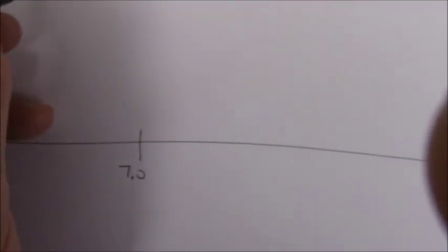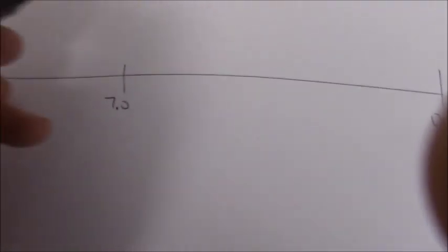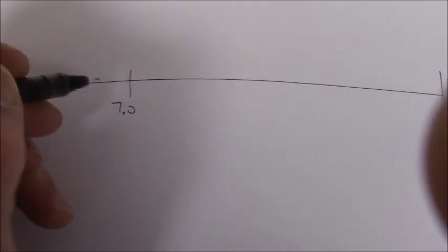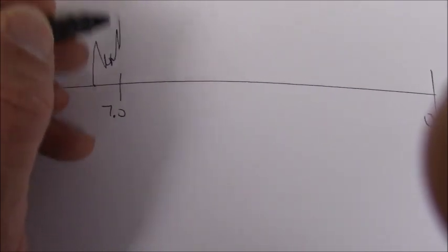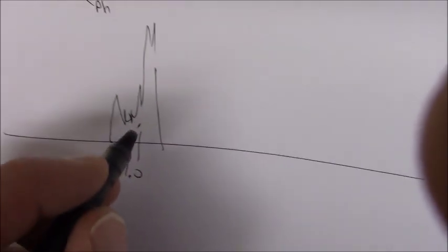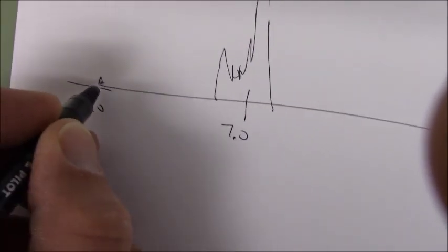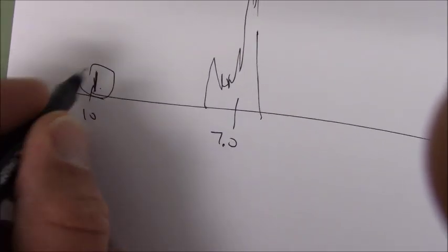But that being said, right around 7, when you run the chalcone NMR on ours, if you had super pure product, you would basically get a lump around 7, and that's all you would see. But a lot of folks end up having a little peak out at 10, which usually indicates leftover benzaldehyde. So if you see it there, that's what it means.